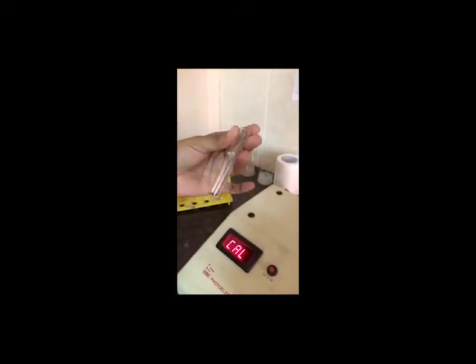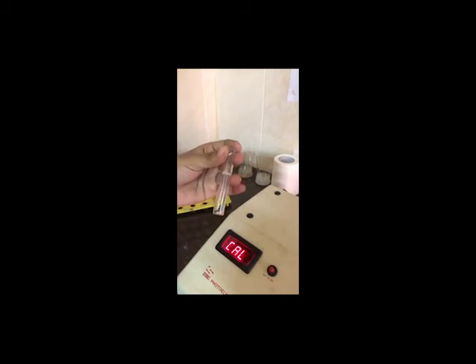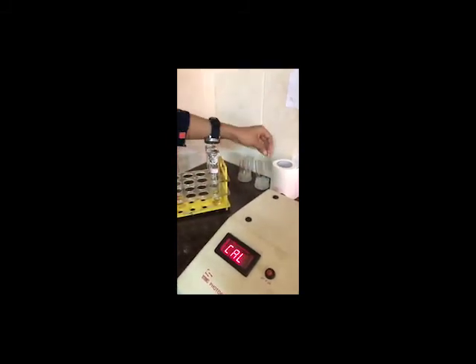The cuvette should be transparent, clean, and devoid of any scratches. Next, we can look at the operation of the colorimeter. Here, we have already displayed the operating procedure. The instrument should be switched on 5 minutes before operation. Here, we have already switched on and chosen the appropriate filter, that is 490 nanometer.